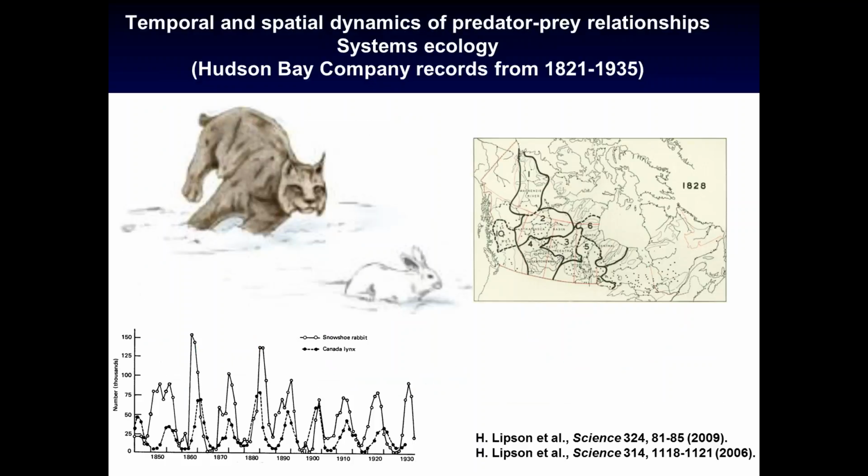Now, I'd like to turn to the untargeted and discovery mode analyses. This is largely motivated from a systems-wide snapshot of what's happening biologically. A lot of systems-wide measurements, I think, find their underpinnings in systems ecology.